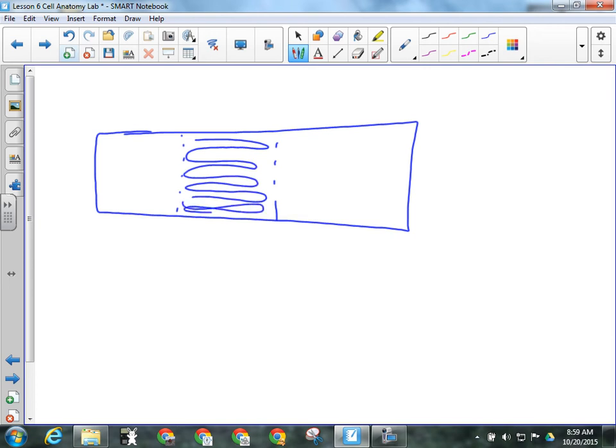You want to twist the cotton swab back and forth, spinning it in your hand as you go back and forth on the slide. That way you smear as much of your cells onto that slide as possible. Everyone with me there? All right. Then you'll put a drop of water on there, put the cover slip on, same as you did with the letter E. This time you don't have to worry about it flipping upside down or not, just slap it on there. That's the one you're going to look at last.